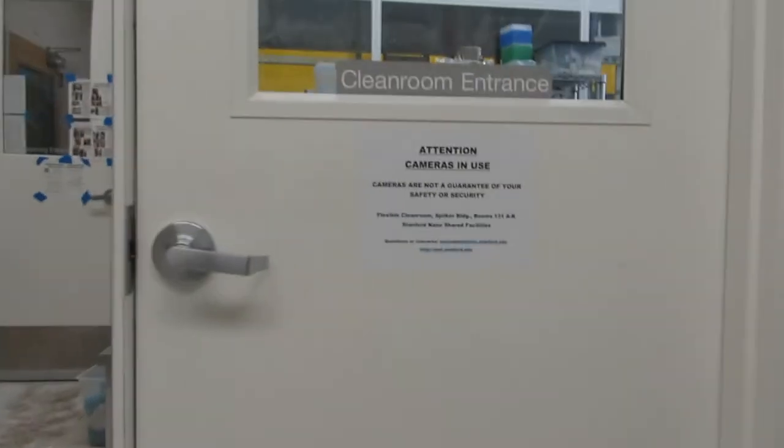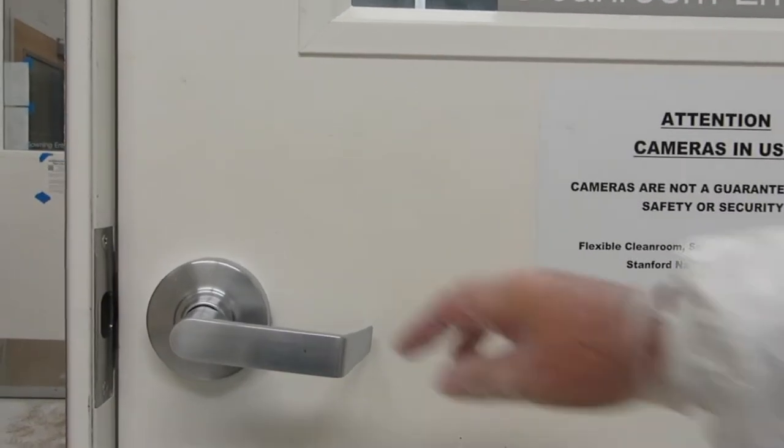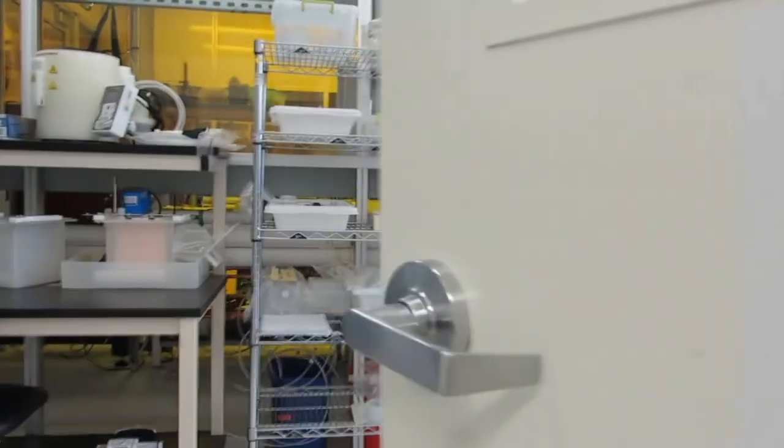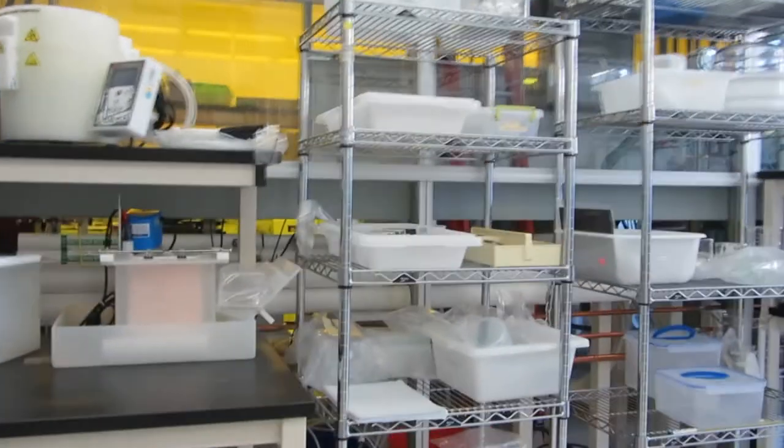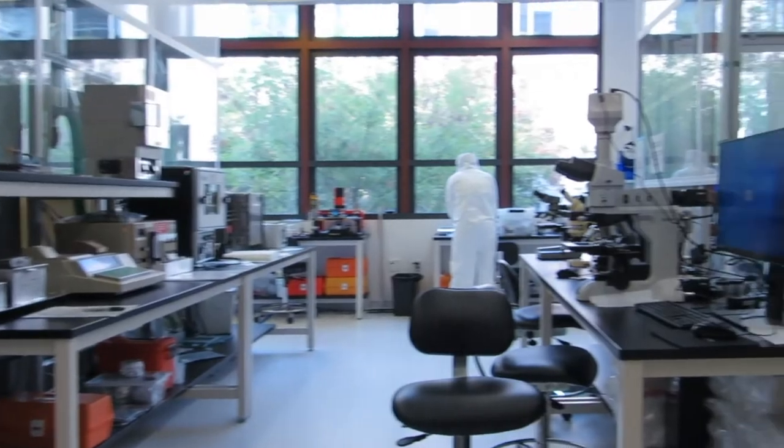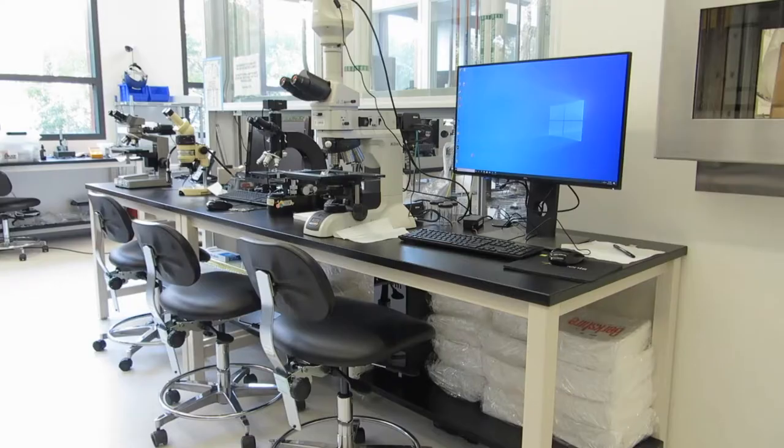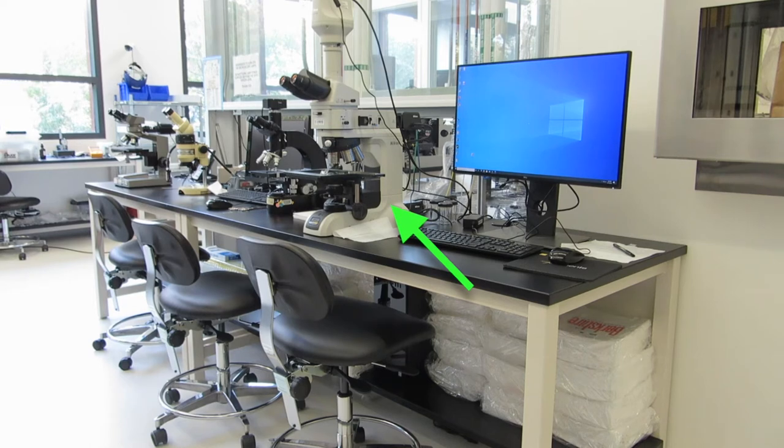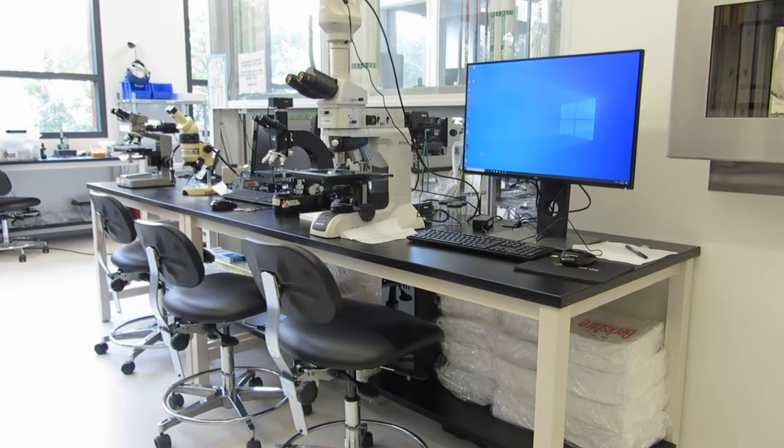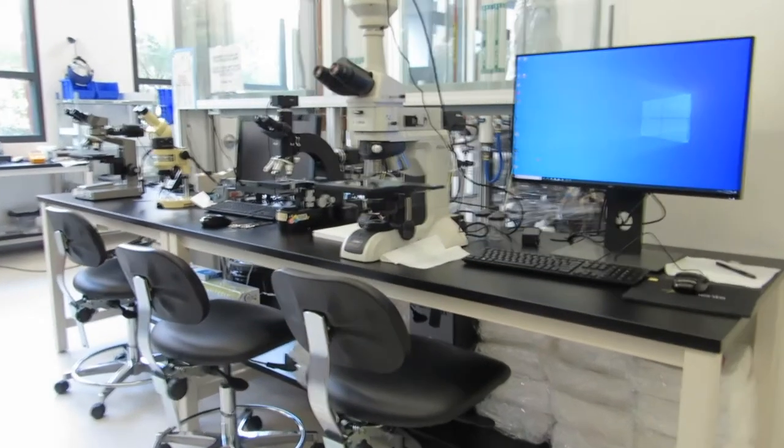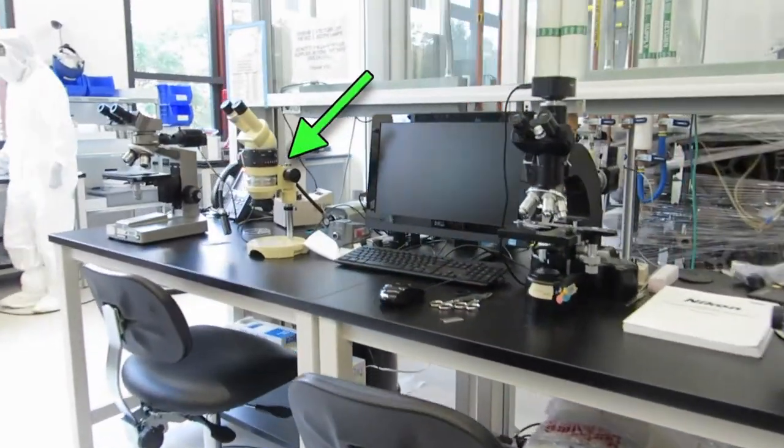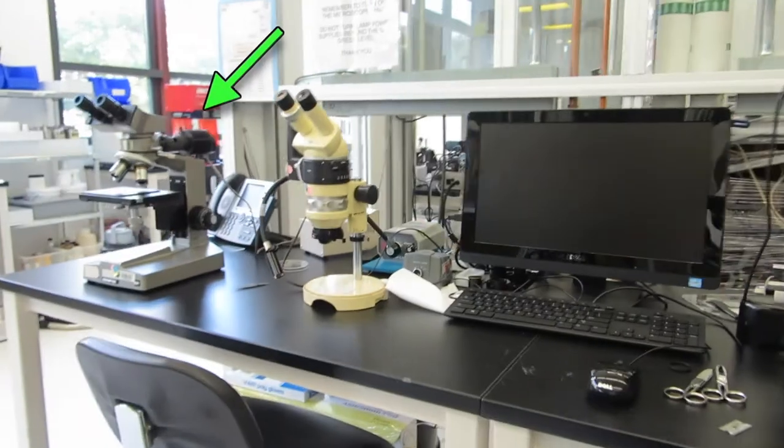After getting properly gowned up in the gowning room, you are now ready to enter the cleanroom. Make sure you are wearing your safety glasses. On the right is a long row of microscopes. The first one on the right end is a brand new very nice Nikon with sophisticated image processing features. Then there's an old high-powered lights microscope, a Wild low-powered stereo microscope, and an Olympus high-powered inspection microscope.